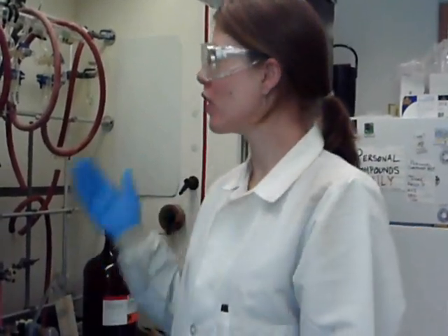Hey guys, welcome back. Today we're going to talk about how to calibrate the vacuum on your Schlenk line.